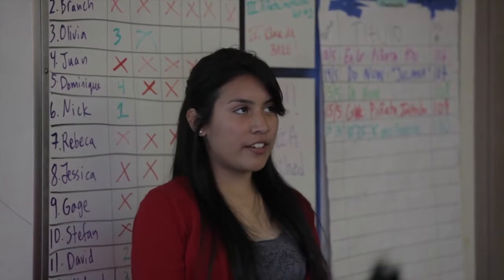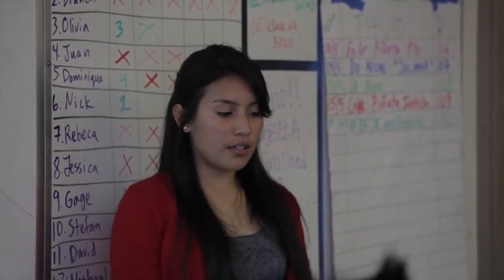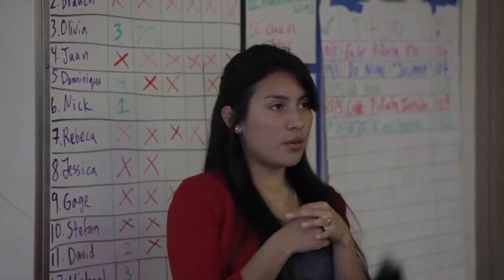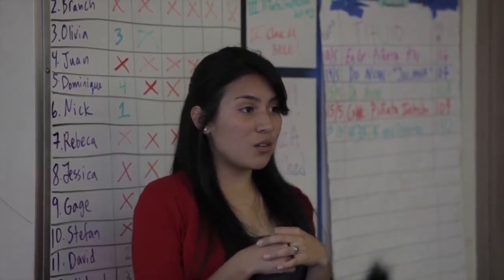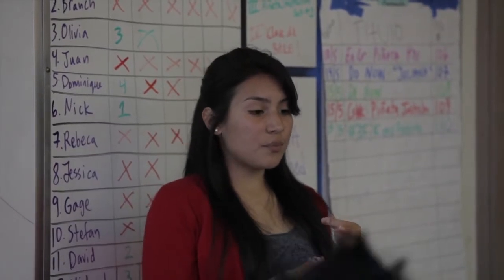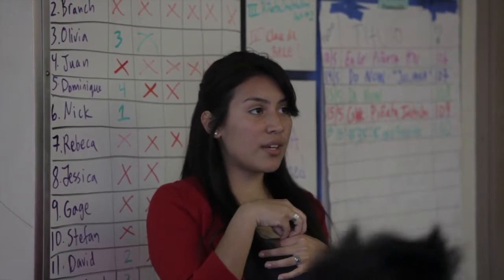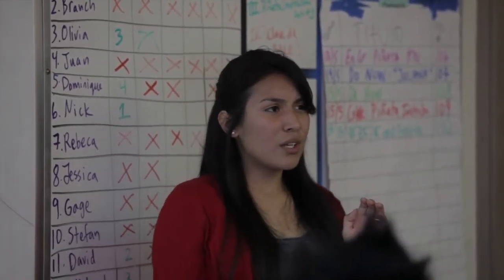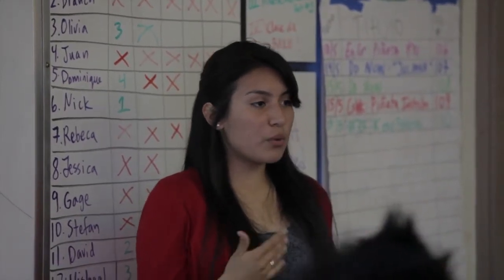One of the sources of error that I remember having was that the probe that goes at the top of the beaker, the one we had initially, had a hole in it, and we didn't realize it did, so our complete experiment wasn't working. It was really tiny, so it was hard to notice, but it was allowing air to come out, and so our data was all over the place. And so we just thought that's the kind of data we're supposed to have, and so we went with it.